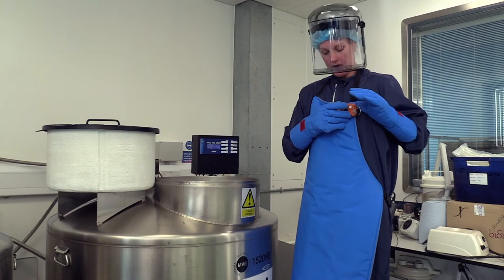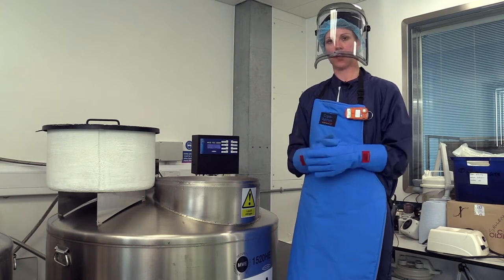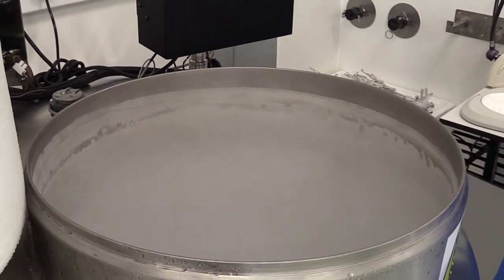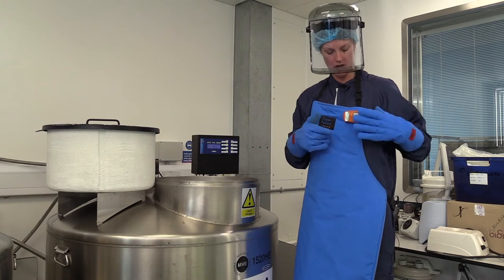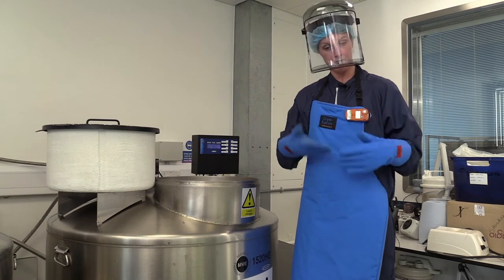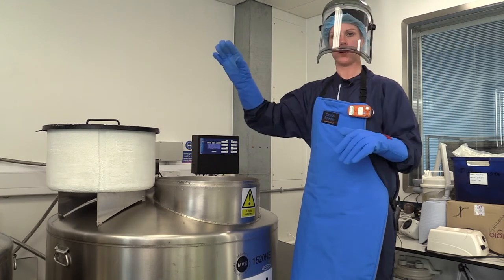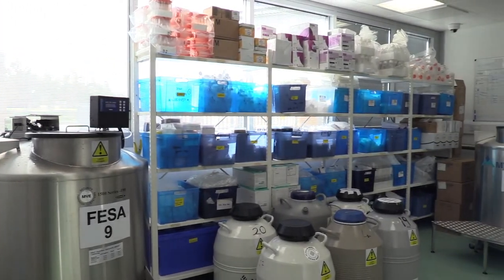I'm also wearing a personal oxygen monitor, because as well as being very cold, the nitrogen vapor can replace oxygen in the air. If it's in a high enough concentration, it can cause death within six minutes. So we always wear the personal oxygen monitor to measure the oxygen concentration we're breathing in, and we also have oxygen monitors throughout the room.